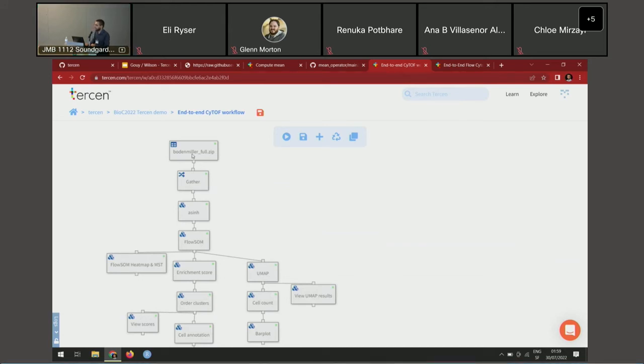And what we load here is from a public dataset from Bodenmiller and collaborators. It's a set of FCS files that are uploaded as a zip. So just so we're on the same page, in flow cytometry, you're measuring the intensity of different markers in cells. So you basically have a big matrix of, I don't know, 10, 20 markers with millions of observations, and each observation is a cell.